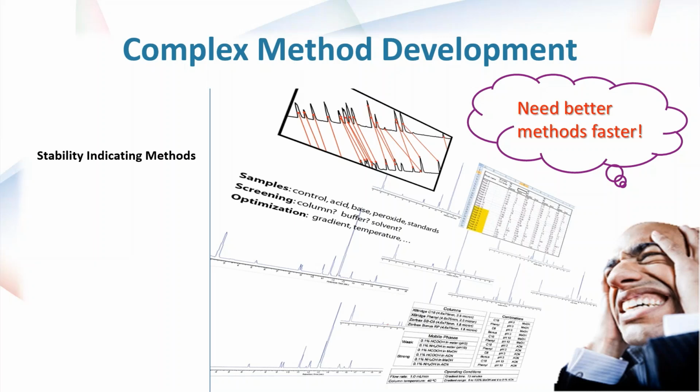Now, as you can see, this would result in a huge amount of analytical data, and at the end of the day, they have to make a decision based on that information. If they're doing chromatographic modeling, then peak tracking becomes important. So typically, if there's a large project with many components and many experiments, that peak tracking could take a significant amount of time. It's routine work, but it's monotonous, and it bites a lot of your time where you could be spending it doing analytical chemistry.